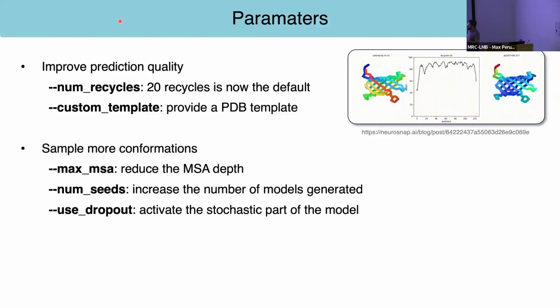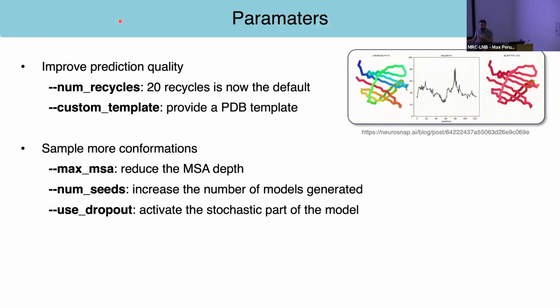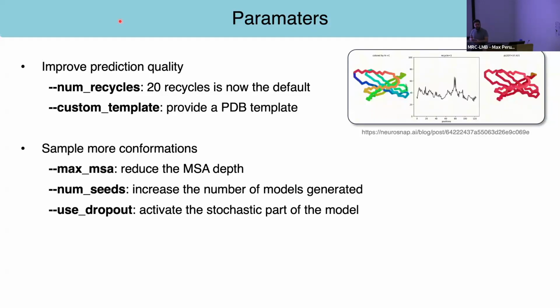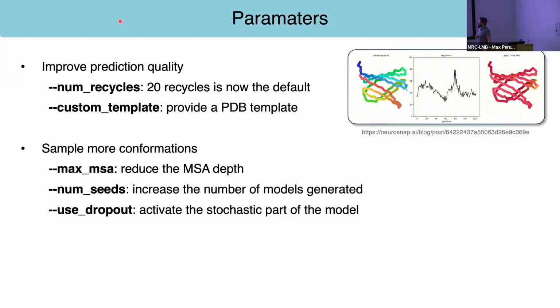There's this idea of conformation and being able to find different conformations of proteins. One of the caveats of this is that AlphaFold usually predicts an open state, and it will fail to predict some closed state of a protein. There have been many ways to try to extract these different conformations from the predictions, to try to trick it, essentially. And one of the really helpful things to do, it turns out, is to play with the multiple sequence alignment. If you reduce the number of sequences in the multiple sequence alignment, it essentially introduces uncertainty into the models, and so they can deviate from those minima, so to speak, in those predictions. So by reducing the MSA depth with this option, you might be able to pick out those different conformations.